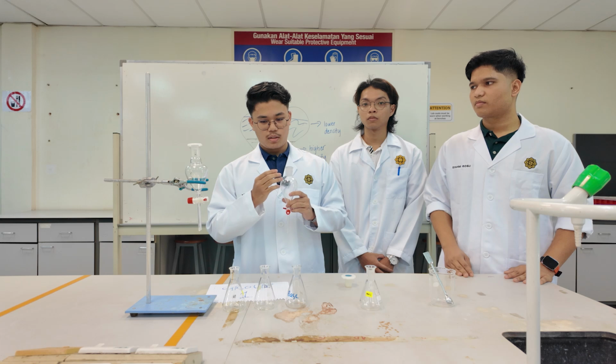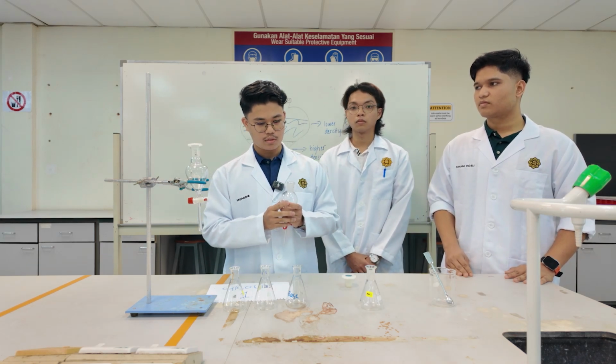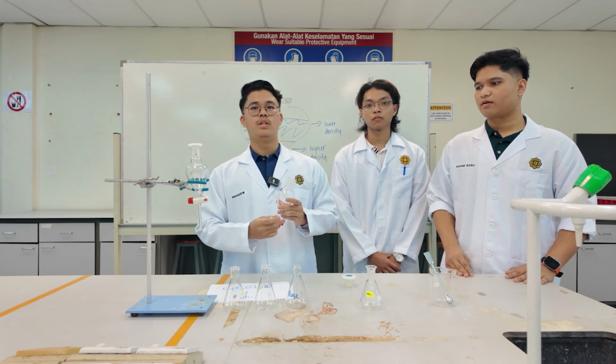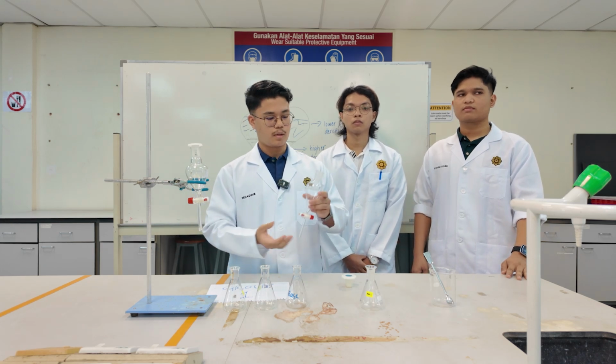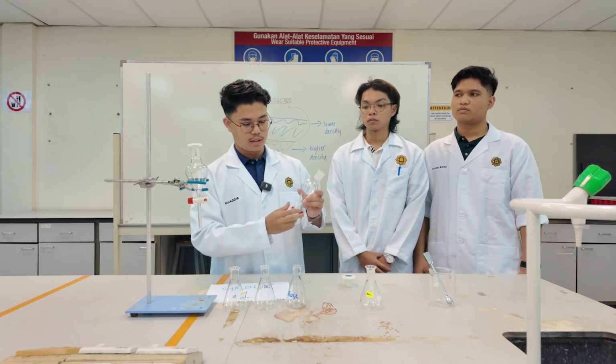To extract the acid, we need to use a strong base, which is 10 ml of 5% sodium hydroxide, and put the sodium hydroxide in the separatory funnel.